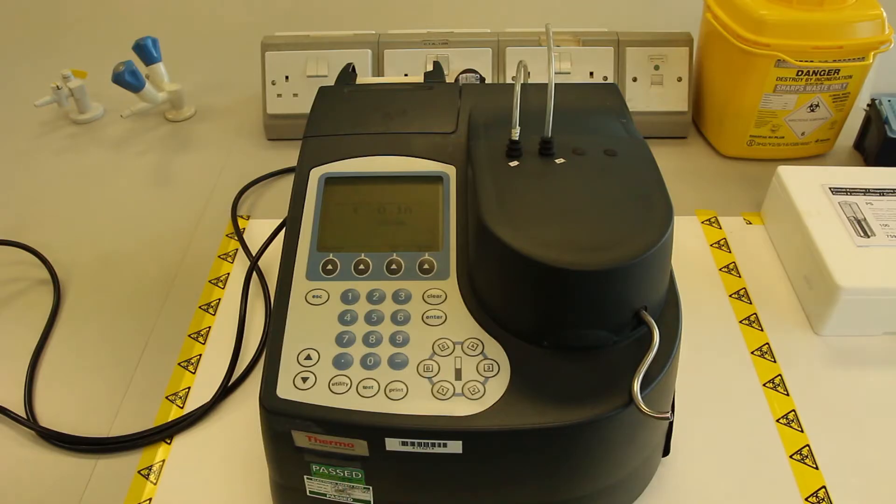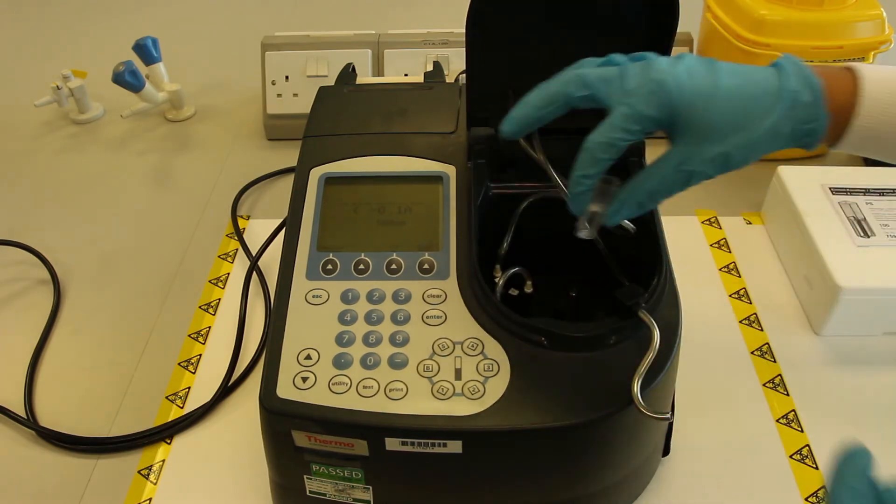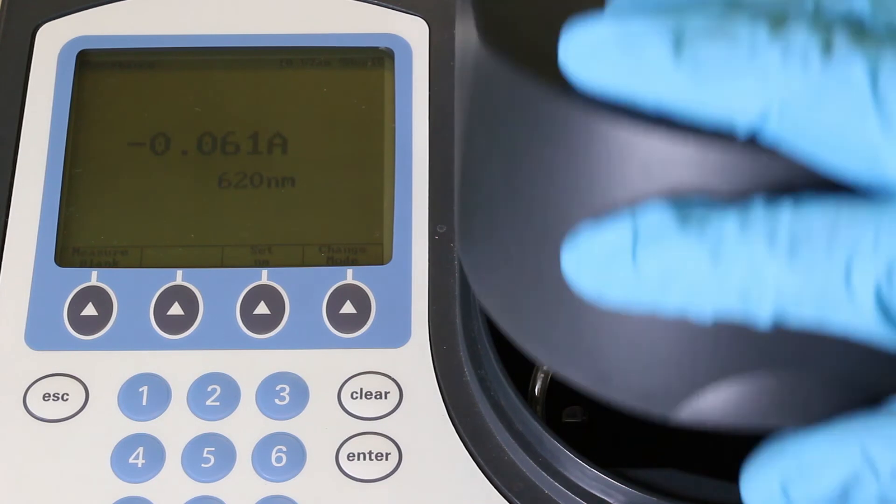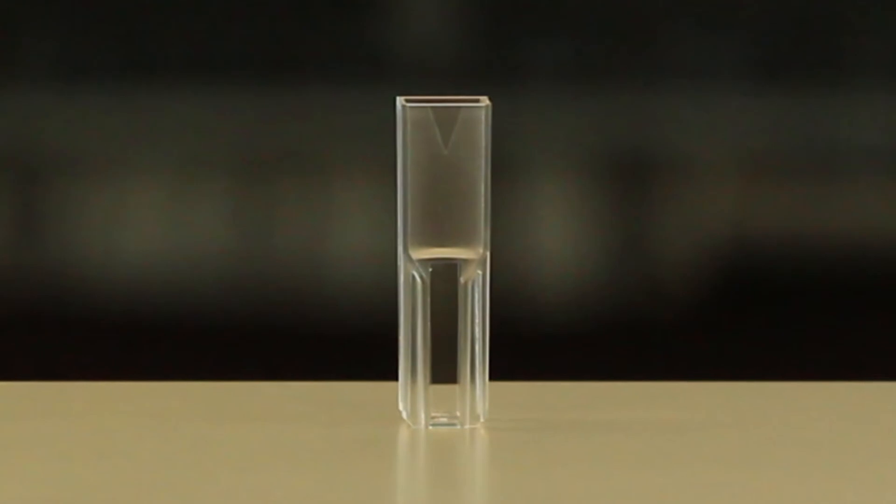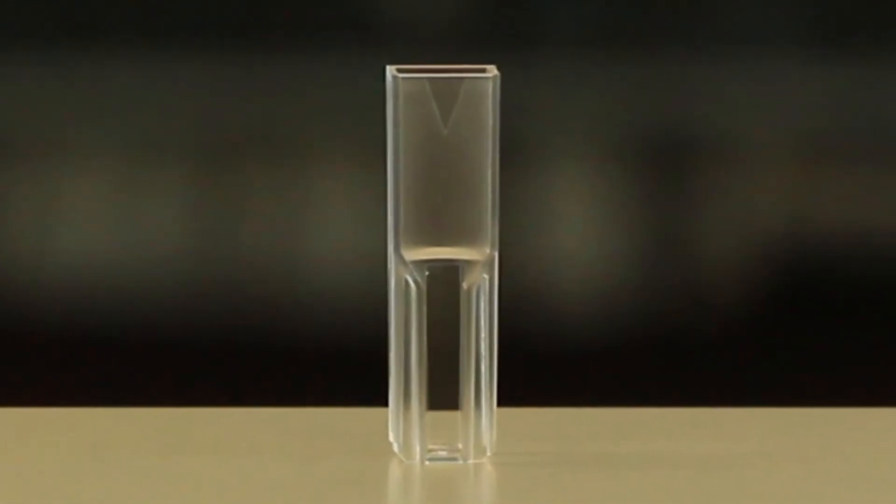The first cuvette to be put into the spectrophotometer will be the blank. Ensure that the clear smooth sides of the cuvette align with the light path, allowing a free passage of all light into the sample. There is a small inverted triangle printed on the cuvette to help you know how to orientate the cuvette when you put it into the cuvette holder.